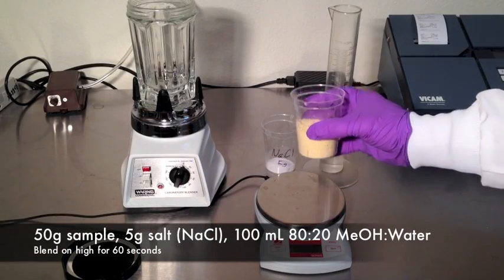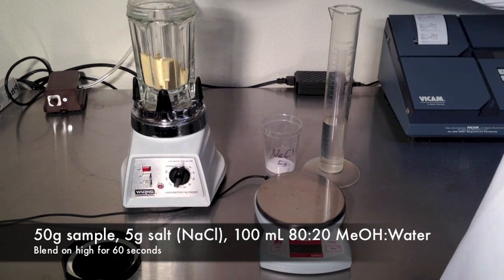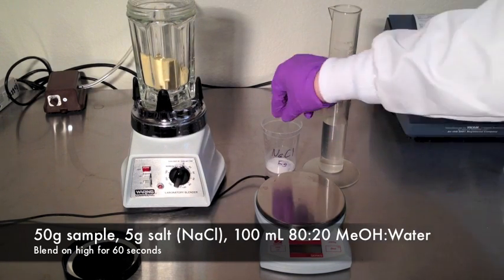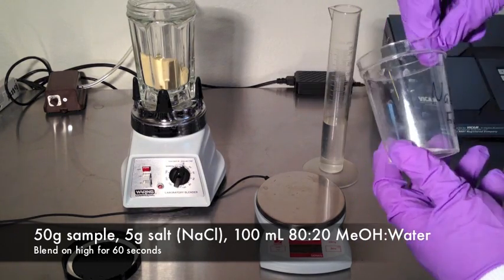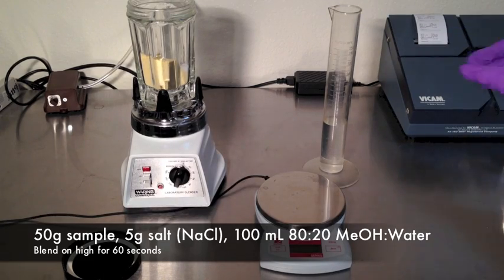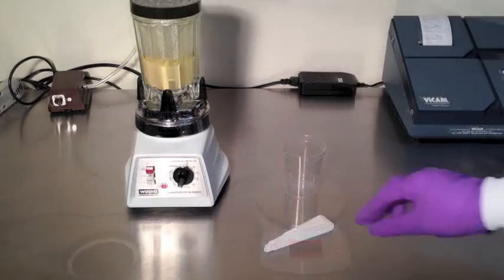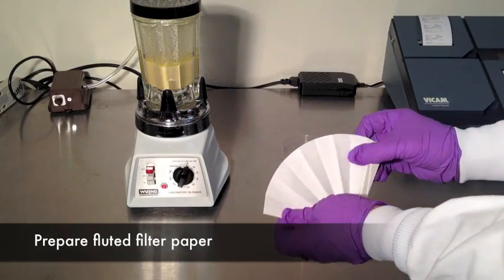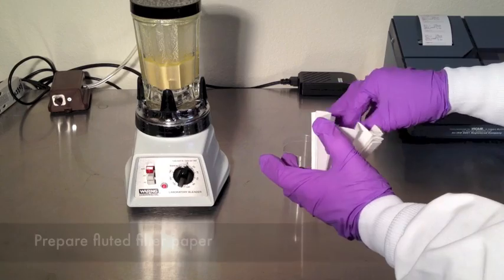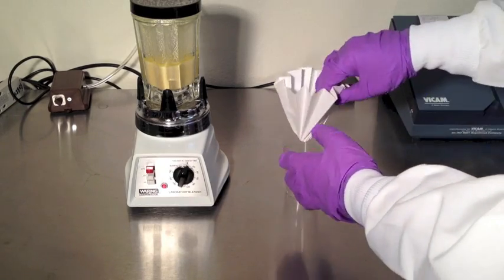Sample extraction. Grind your sample. Weigh 50 grams of the sample. Combine with 5 grams of pure salt. Add 100 milliliters of 80-20 methanol and water. Cover the blender jar and blend at high speed for 1 minute. Pour the extract into a fluted filter paper and collect the filtrate into a clean collection cup.